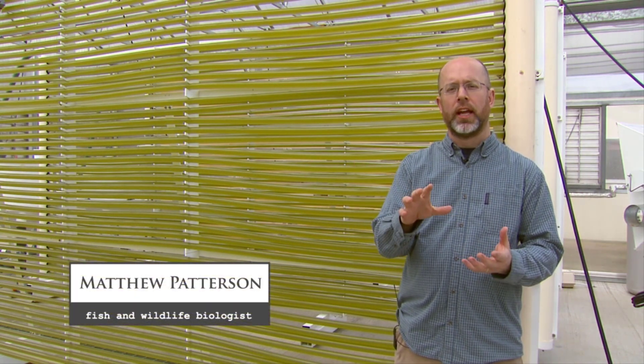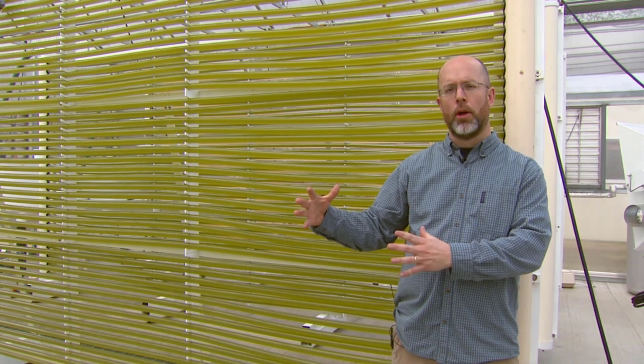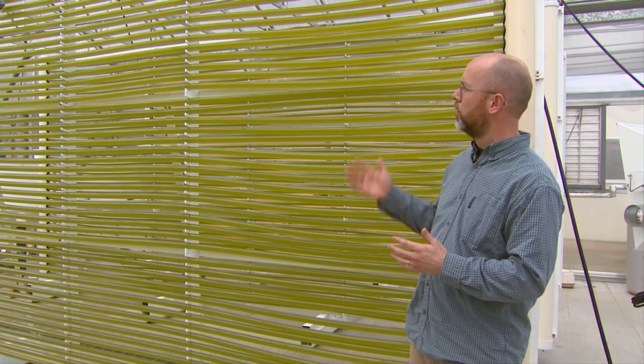We've been talking a lot about stepping up our algae cultures from small systems to larger systems. We started out with the slants, went to the flask, then to the carboy. If you're a facility that really needs a lot of algae — say you've got a large number of juvenile mussels to feed or you're holding adults for broodstock — you might need to take it one step further. There are several options out there, and this is just one: it's called a photobioreactor, and it cultures algae at a much larger scale.